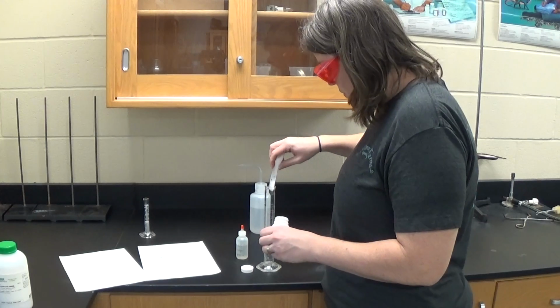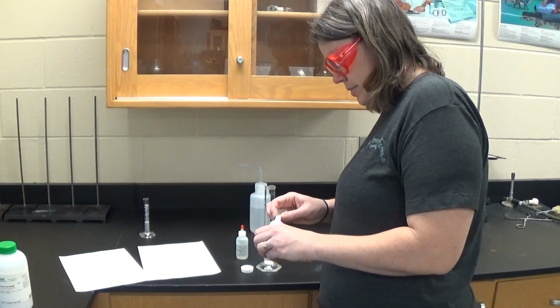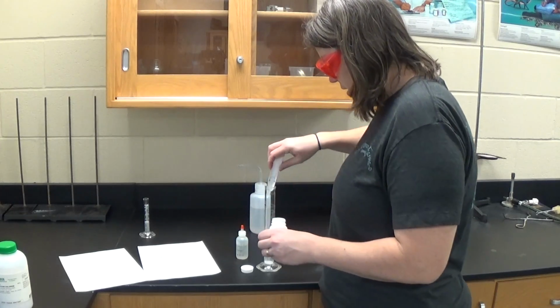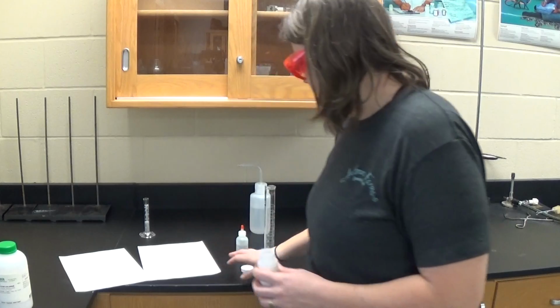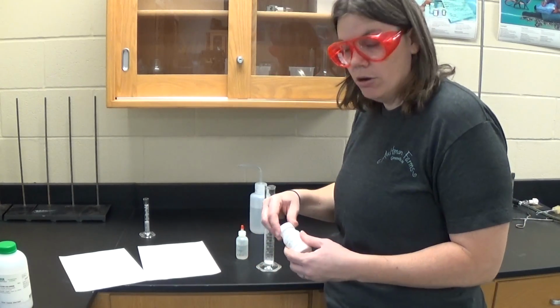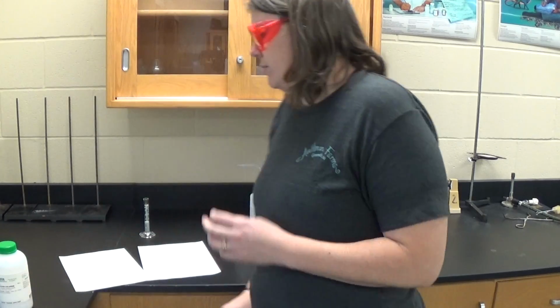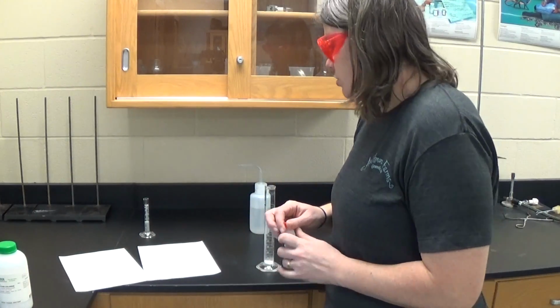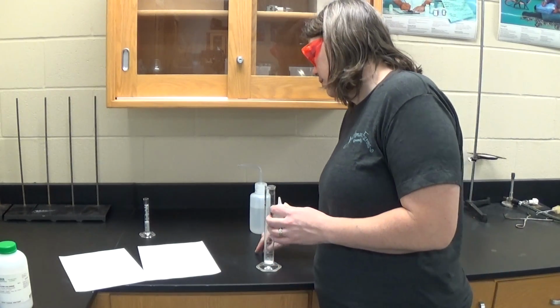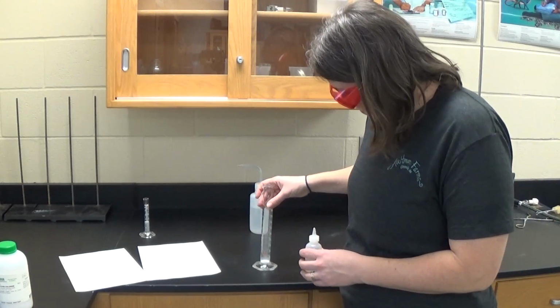So there is 1. And 2. Go ahead, put my scoop over there, put my lid back on. Put that over the side. And now it also says to add enough vinegar to fill it up to the 5 milliliter mark. And it says to do it dropwise, so let's do a little bit at a time.